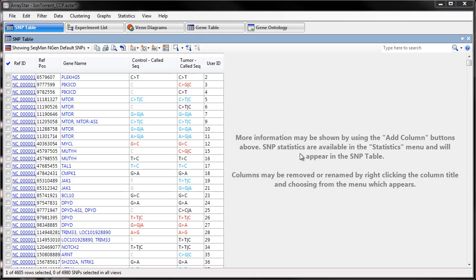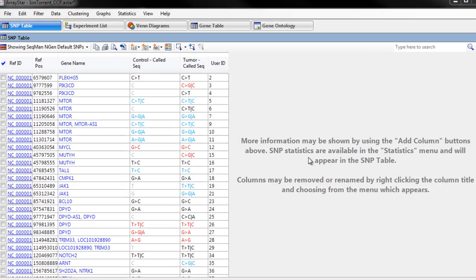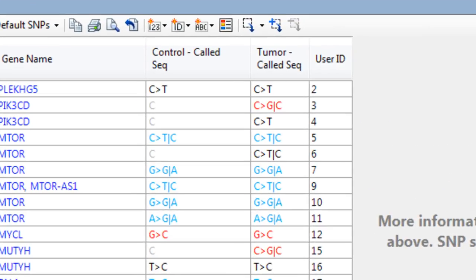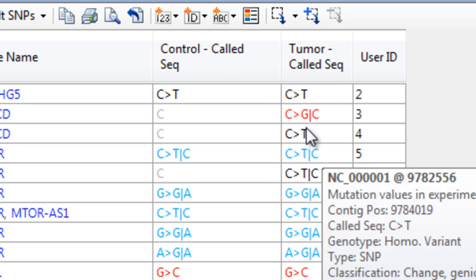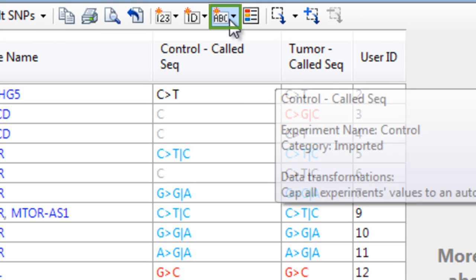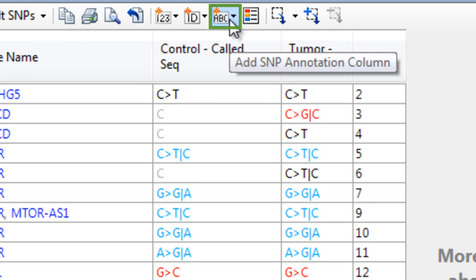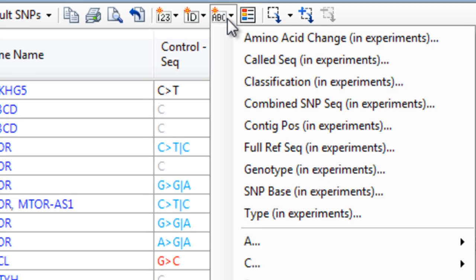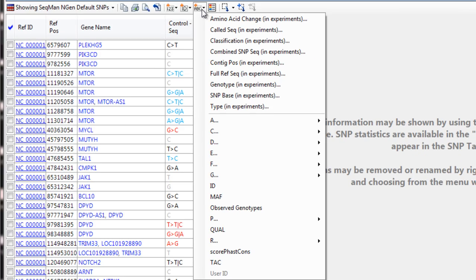To view annotations from the new VCF files, click the ABC icon in the toolbar to add annotation columns. Then navigate to the information you want.